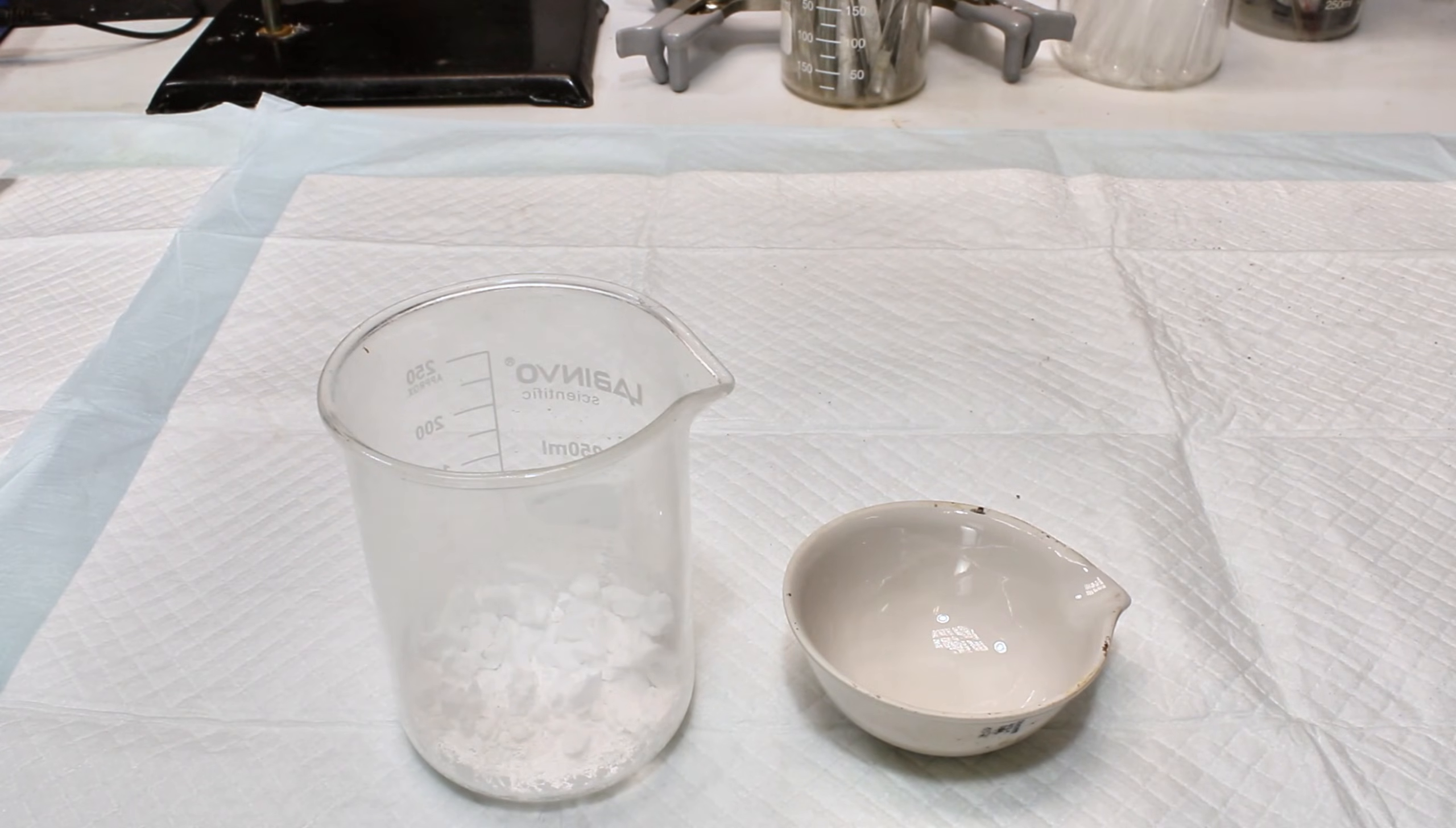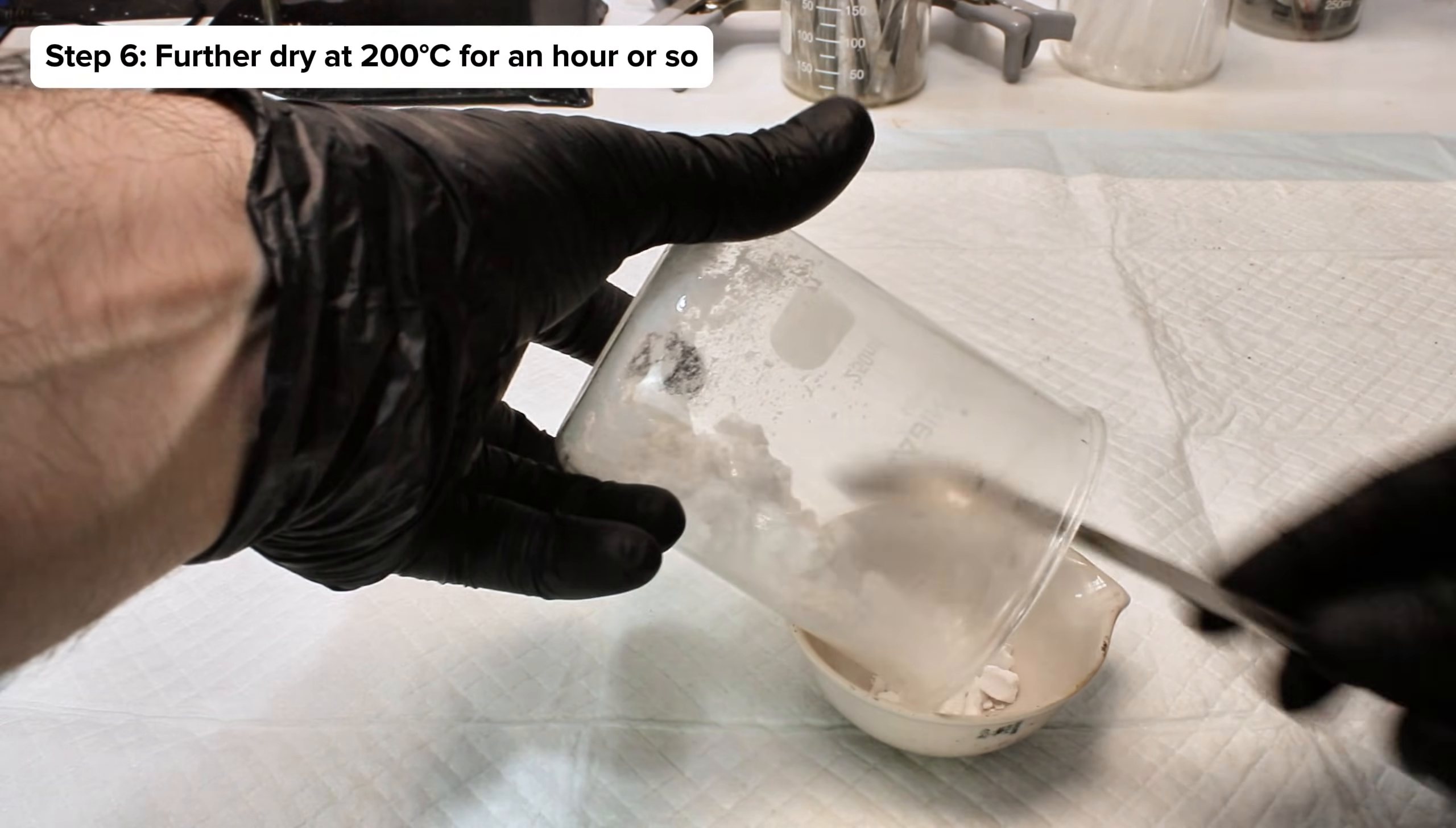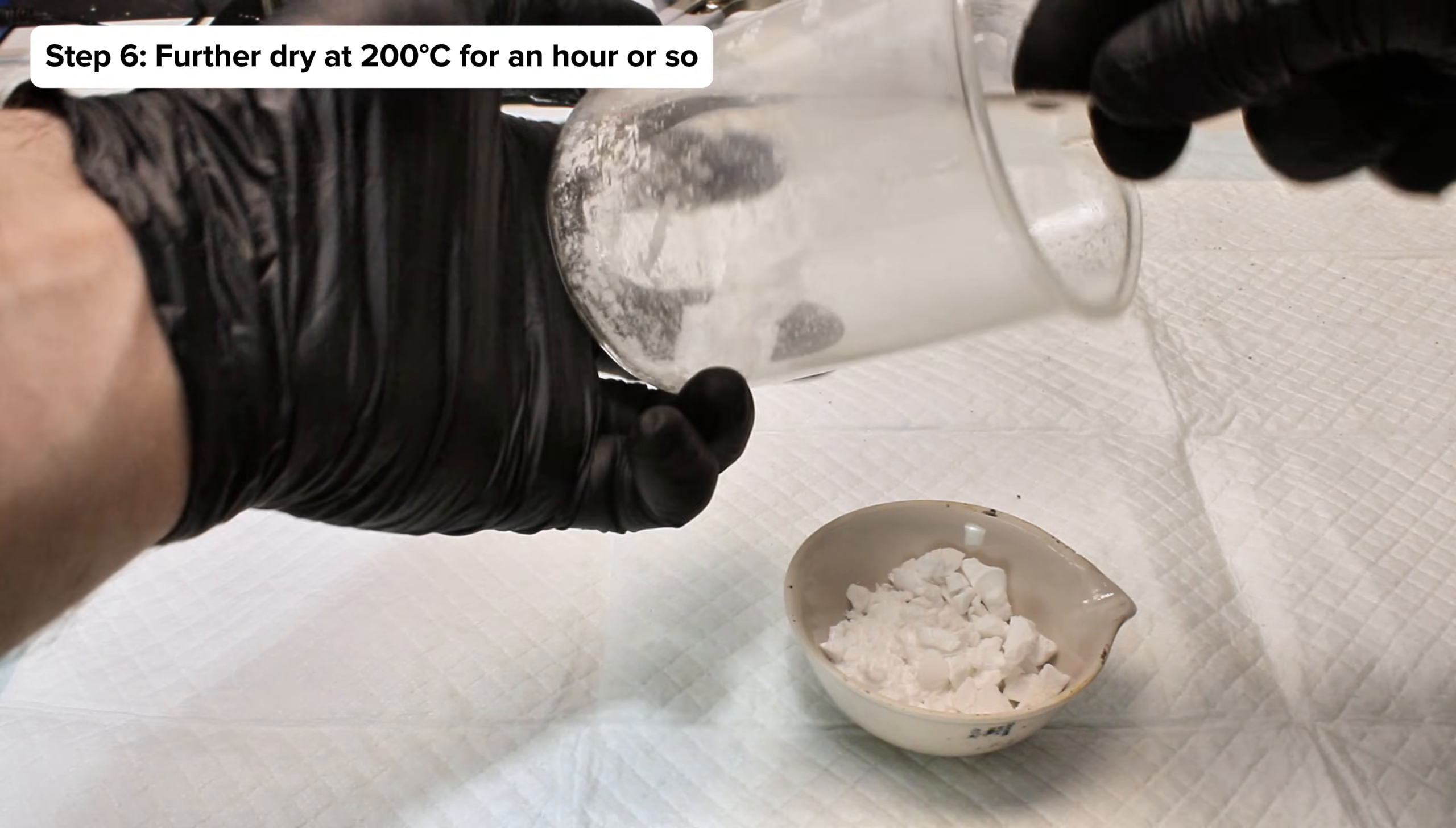Once stirring eventually became difficult, I took the beaker off the heat, allowed it to cool, and then transferred the fused salt mass to a porcelain crucible. This was then placed in my toaster oven and heated at 200 degrees Celsius for a few hours to drive off as much water as possible.